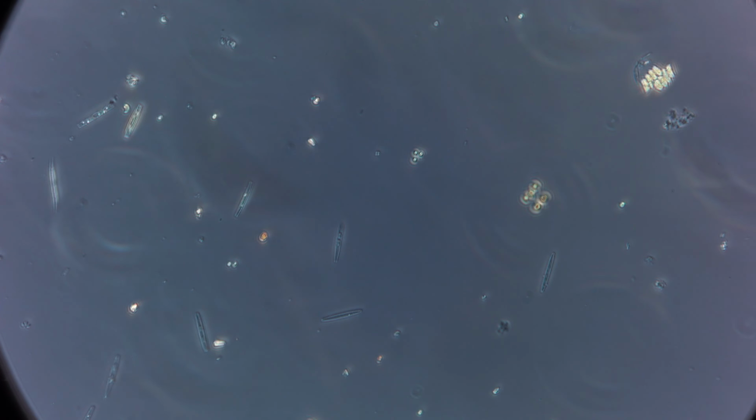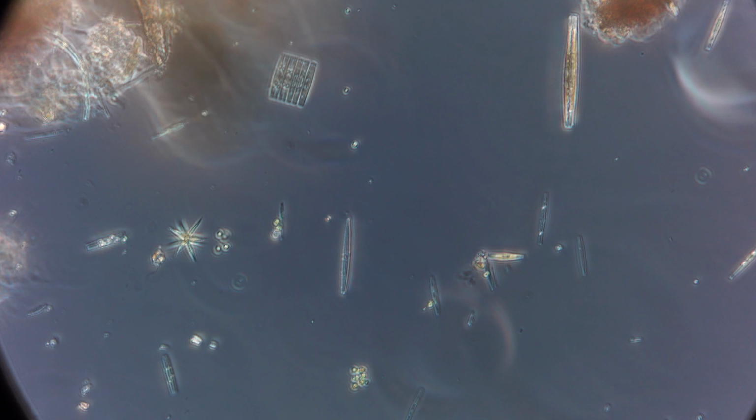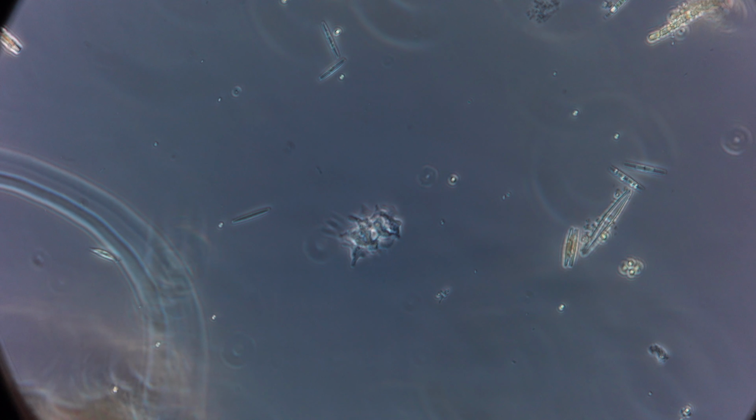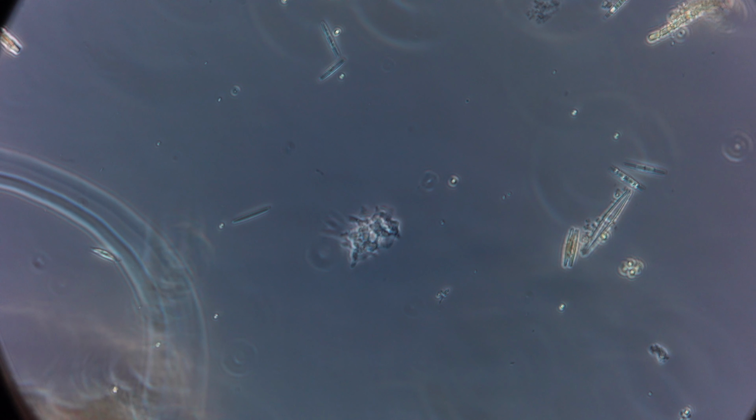I don't think we're going to get very good time lapse out of this, unless we do amoebas. So this is at 200 times magnification. Doing something.